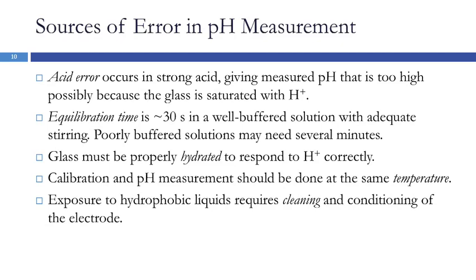If you expose your glass electrode to hydrophobic liquids such as methylene chloride or oils or fats, those can foul the glass membrane and cause it to not respond correctly. They're not going to rinse off with water because they're hydrophobic, and so they'll need to be cleaned with an appropriate solvent, and then you have to condition the electrode to make sure that the glass is properly hydrated again.